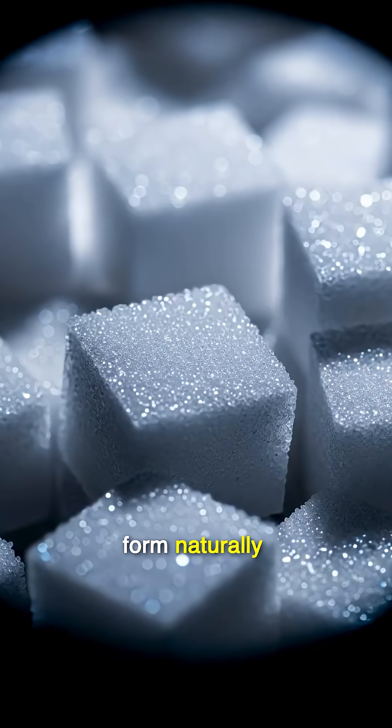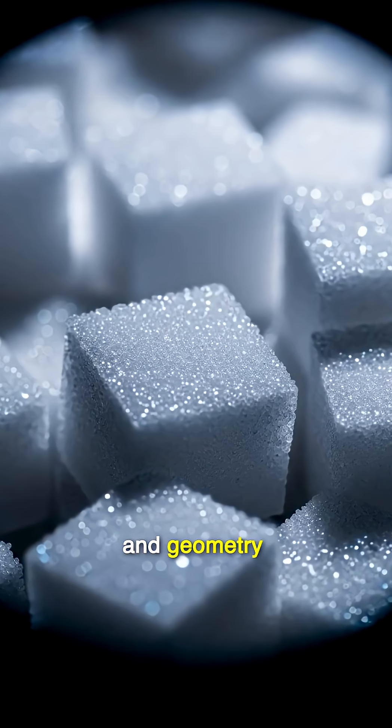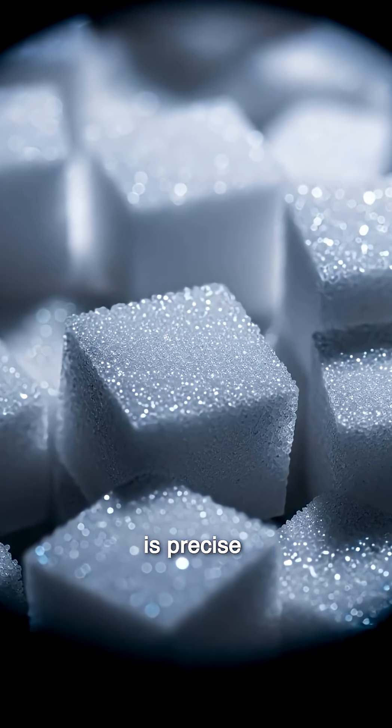These perfect cubes form naturally, shaped by chemistry and geometry. Their arrangement is precise.